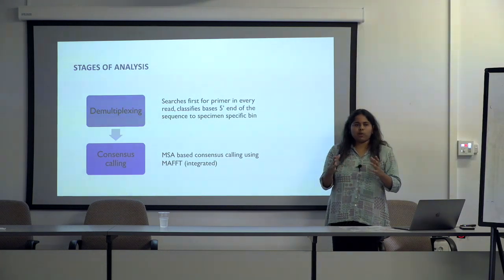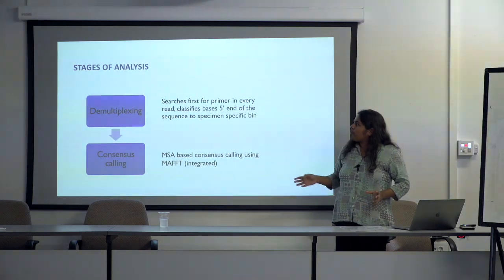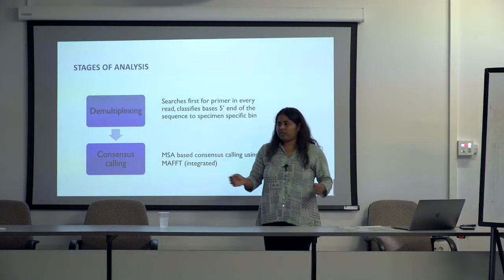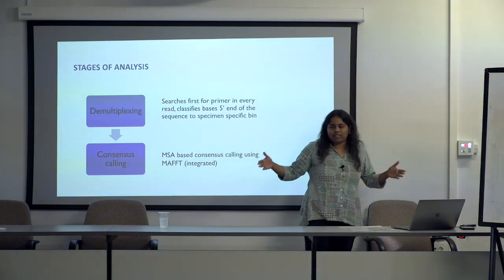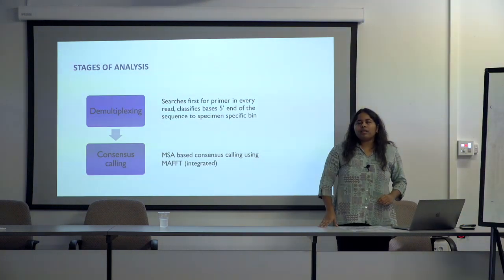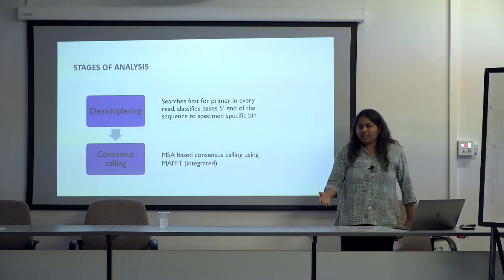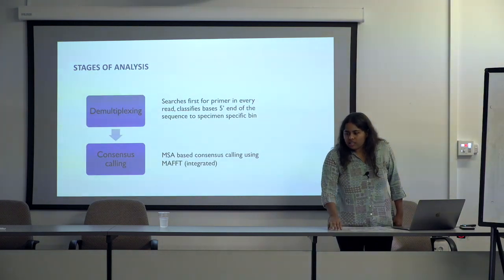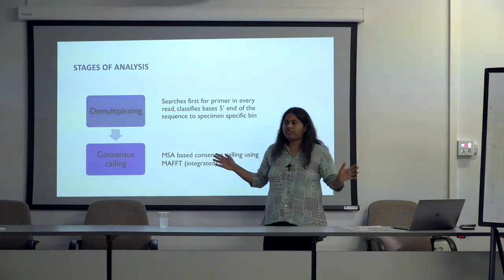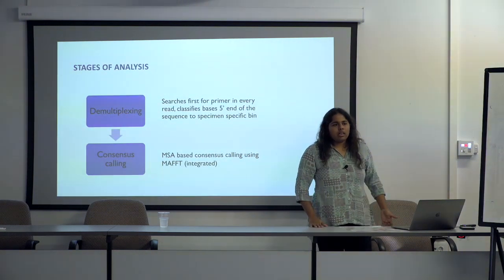You have these polishers for genome assembly projects, and they were not giving us great data, because they would usually trim away chunks of your barcodes, and we want the full length amplicon to be handled properly. What we realized worked nearly as well as the consensus calling tools was reducing the gap opening penalty in MAFFT and just doing an MSA and calling a consensus.